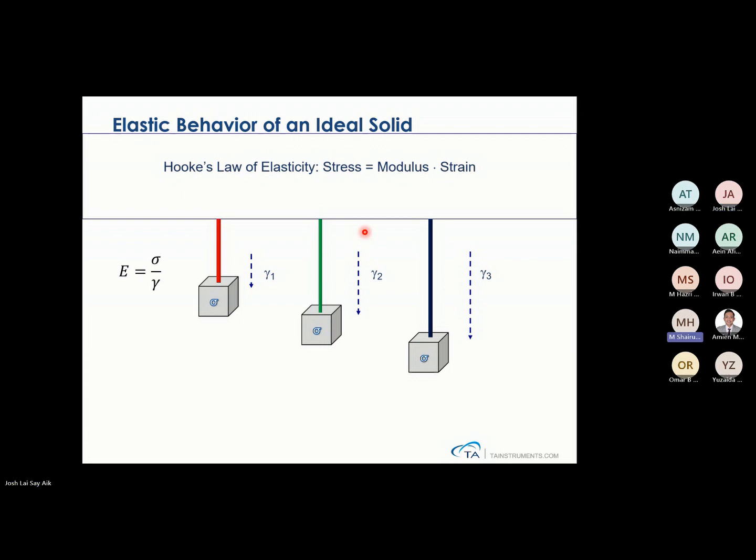This one. This principle, modulus as per the formula, it almost applies to tensile, right? Okay, I'll explain this later on. Please continue. But for now, just keep in mind what elastic behavior is, because it's important for you to understand viscoelasticity. I'm going to tell you the differences between tensile and this one. Okay, right.